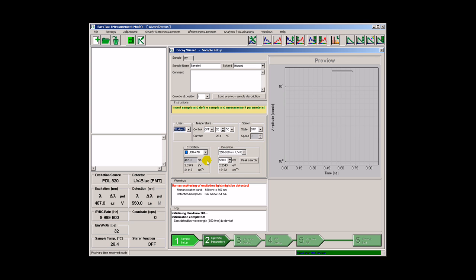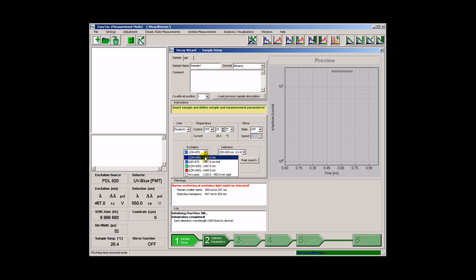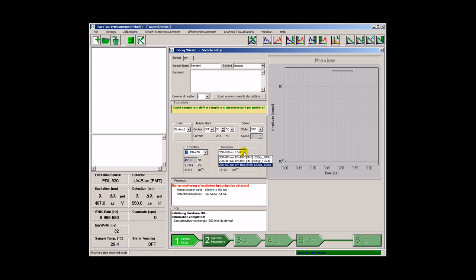The most important is to choose a suitable excitation source from the available options. Similarly, one can select a suitable photomultiplier and grating combination.